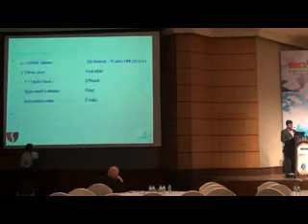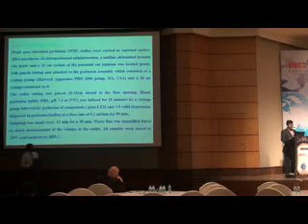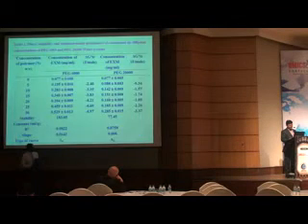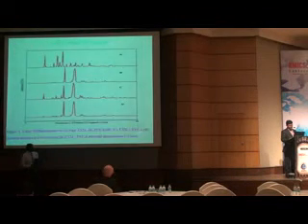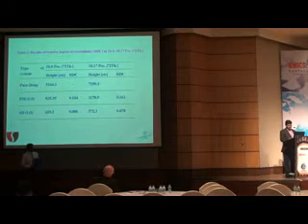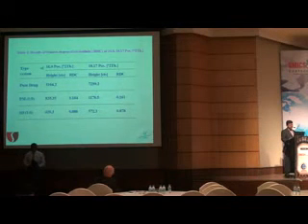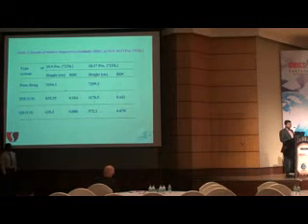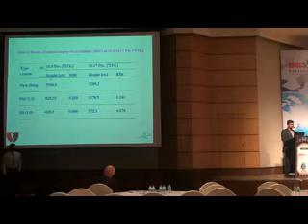So this shows improved permeability as well as solubility with the solid dispersion. The solid dispersions of ebastine with polyethylene glycol 6000 showed enhanced solubility and dissolution rate, and they also exhibited enhanced permeability in these in situ studies. However, this has to be further confirmed by carrying out studies in in vivo animal models, which we are planning to proceed with.